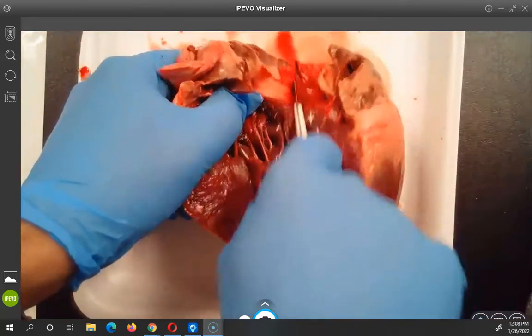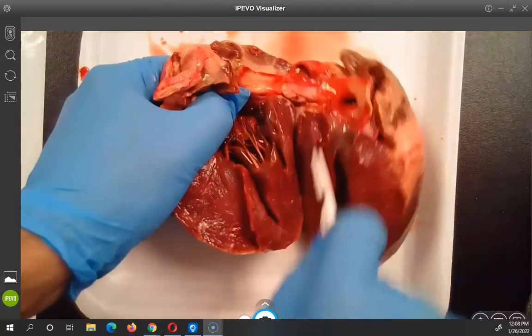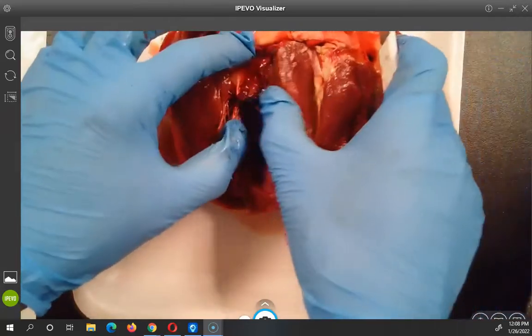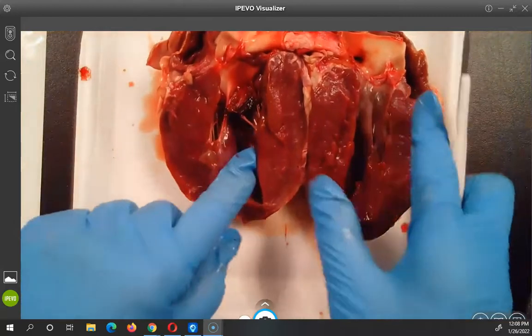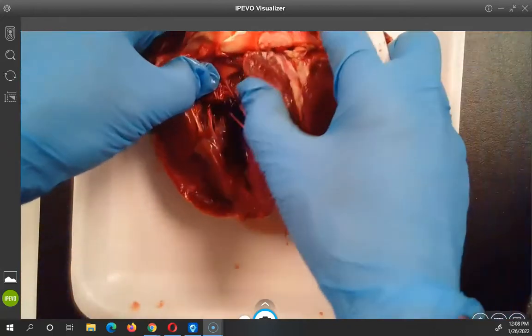It's still hot — whoa, look at all these cool things. I don't know what those are. I saw it on a video beforehand. You need to learn this beforehand! I did, but I forgot. It's got so many names. So here are your ventricles, and the atriums are up here.